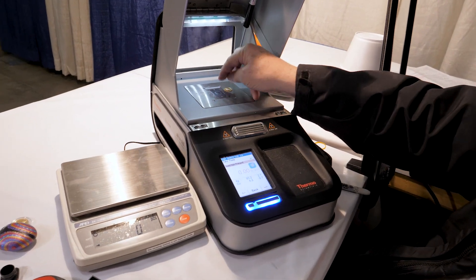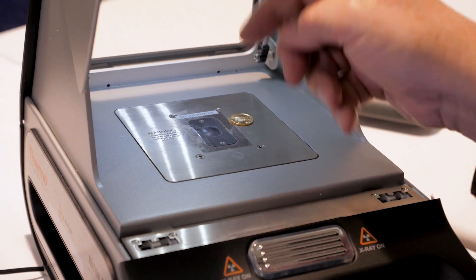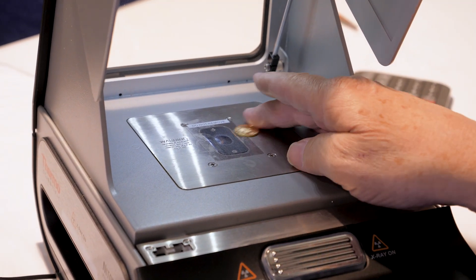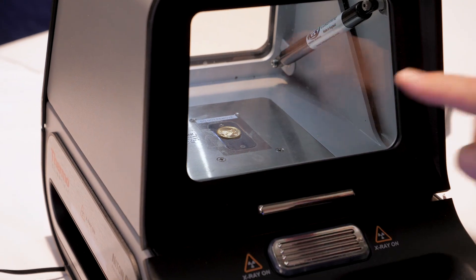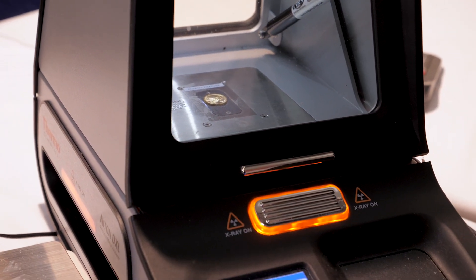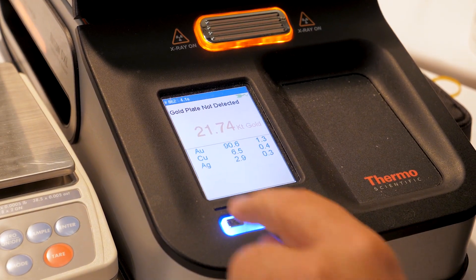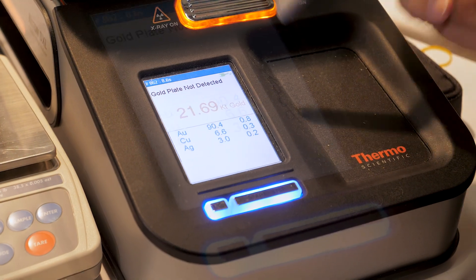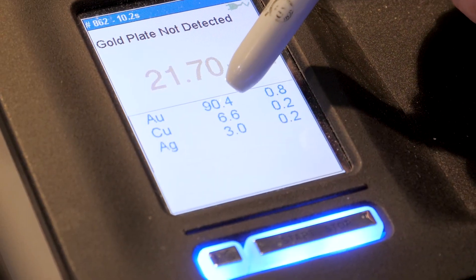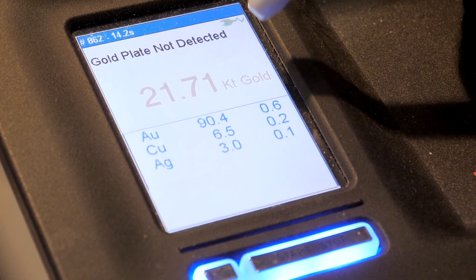Put that right in here — this is the little x-ray eye right in here. It x-rays and breaks down exactly what the metal content is. These are sold as fine gold, and you will see it's not 24 karat gold because the government puts in a little bit of copper. You've got 90% gold, 6% copper, 3% silver. This is a complete breakdown.